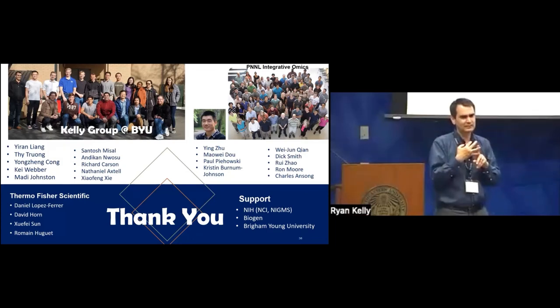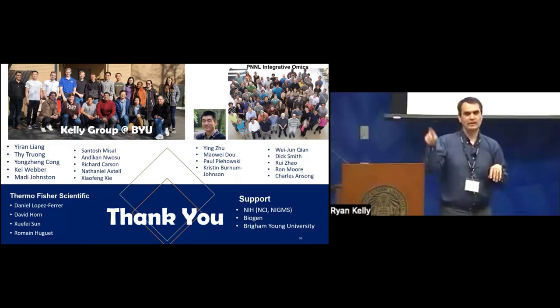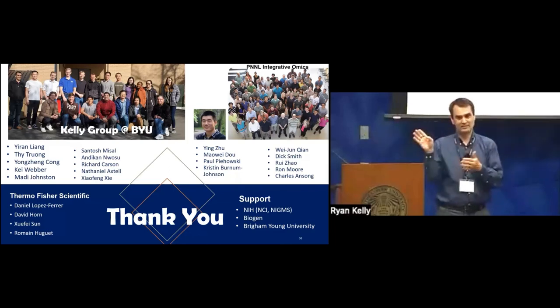Does anybody know? So we just were like, well, we're just gonna be way more conservative than that and call it good. And you can also see when your match between runs starts to drop off a cliff, where you're excluding things, that you're getting rid of a lot of good matches if you go too tight, like 0.01 ppm, right?